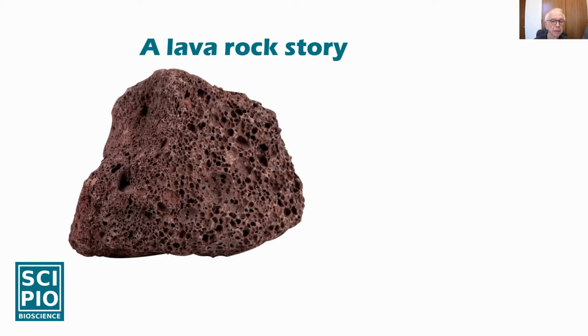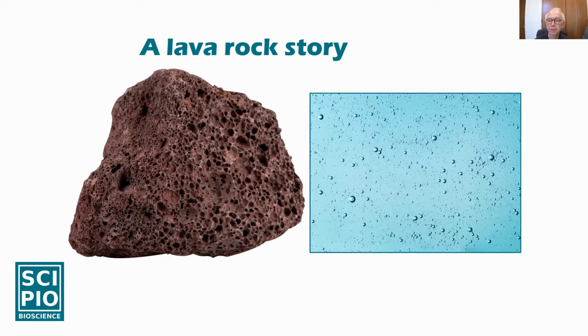Of course, it would be terrible and impossible to fill these little holes, but thinking about it made me arrive at the idea that the way the lava rock is formed, with the bubbles of gas that are eventually eliminated and leave these traces, the same idea could be applied to cells, in which the lava rock or a gel is formed around the cells. So that was basically the inspiration for trying to come up with a kit based on a hydrogel that would encapsulate the cells.